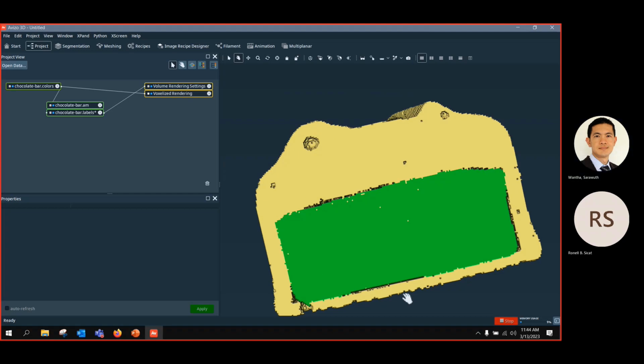Which are the two differences? If I have some complicated case, I use segmentation. If I want to optimize, I use thresholding. Yes, exactly. This chocolate bar could be automated really quickly, but if you have something like a skeleton or vasculature that you want to trace manually, maybe that's the tool where you have more control with your hand. Sometimes automatic segmentation with thresholding will not work at all because the signal is too diffuse and too similar.